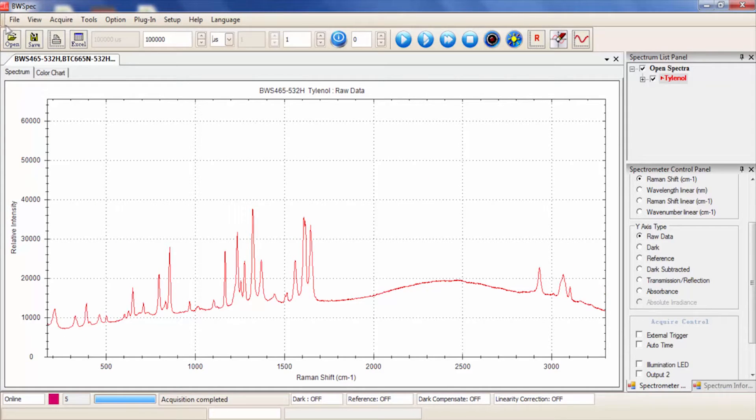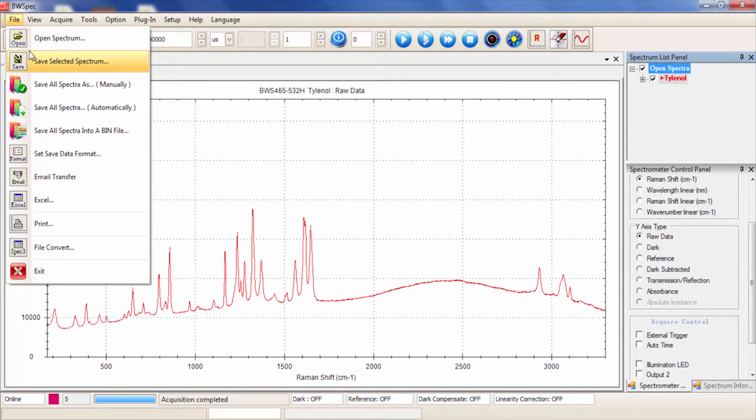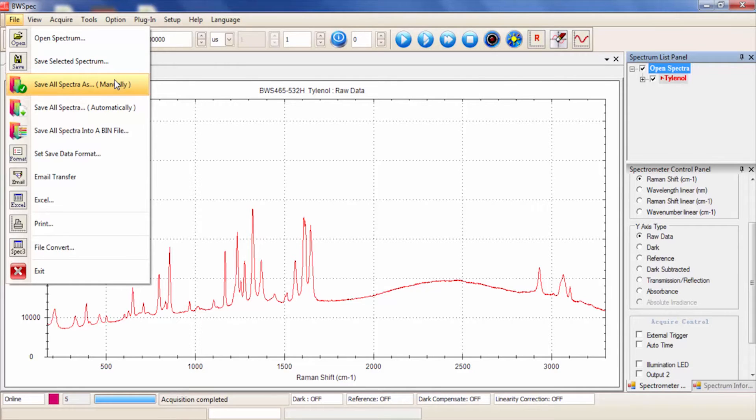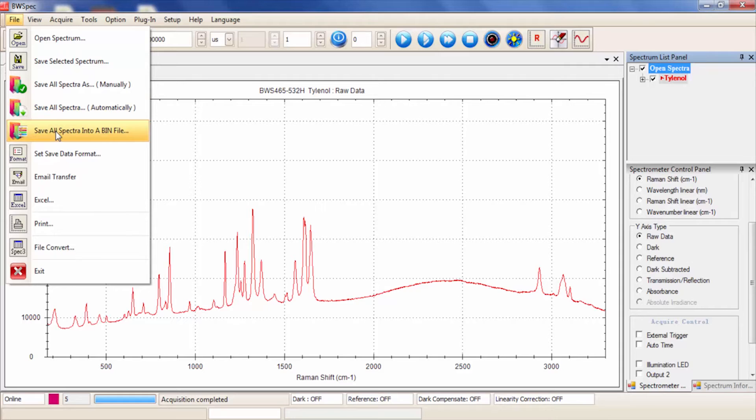You can also go to File and Save, which gives you all the options I just explained. If you have multiple spectra open, you can save them all at once and manually choose the file name, or automatically save them, which saves as the default name in the Spectrum List panel. If you want multiple spectra saved into the same file, save all spectra into the bin file.